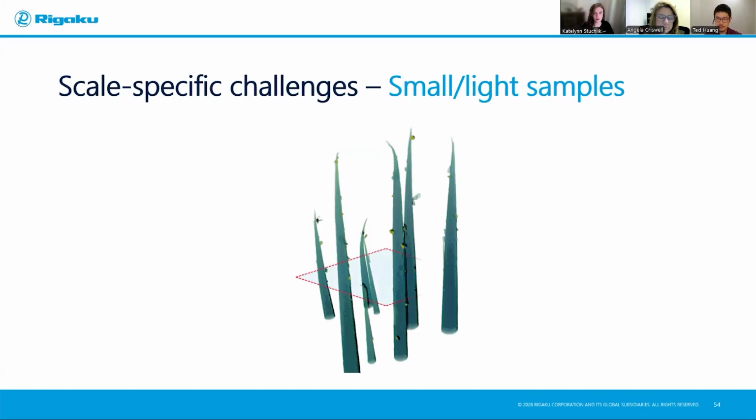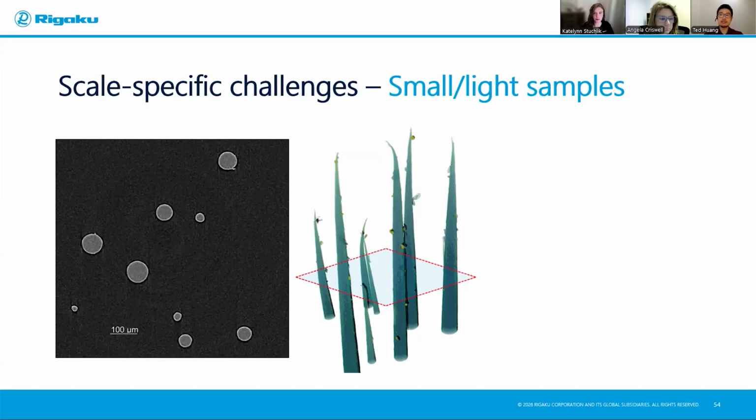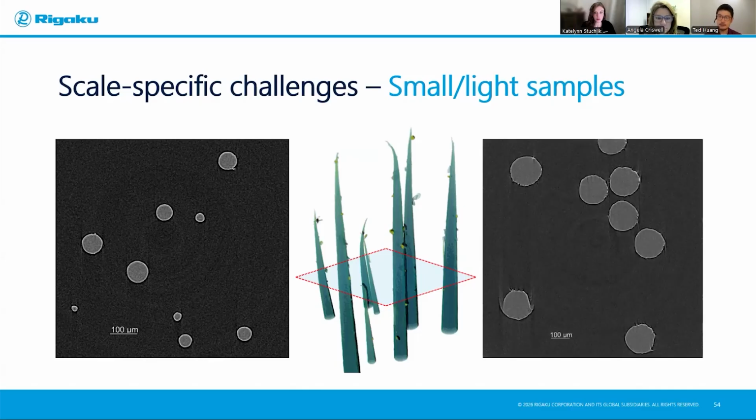When you scan it, and then you imagine you cut it open virtually and look at the cross-sectional views of these fibers, what do you expect to see? Something like this, right? The cross-sectional views, the cylinders, the circles of these fibers. Now, maybe when you do the scan and you come back, instead of seeing these circles, you actually see something like this. There are some distortions happening. Is it because my fibers are jagged? It's not a smooth surface.